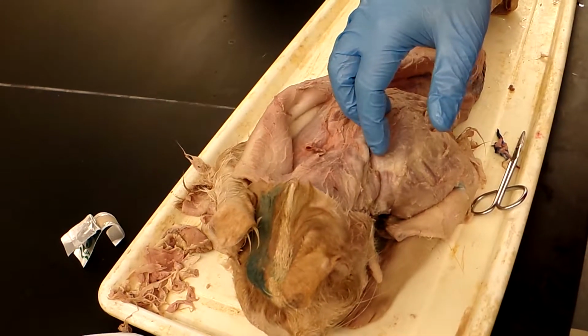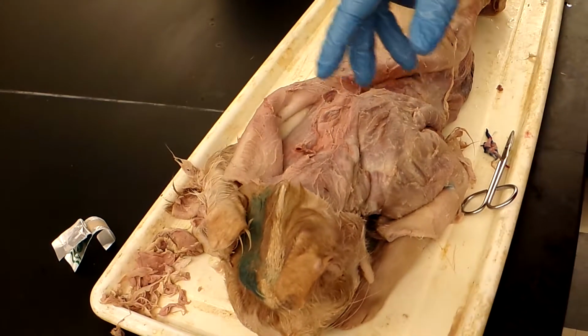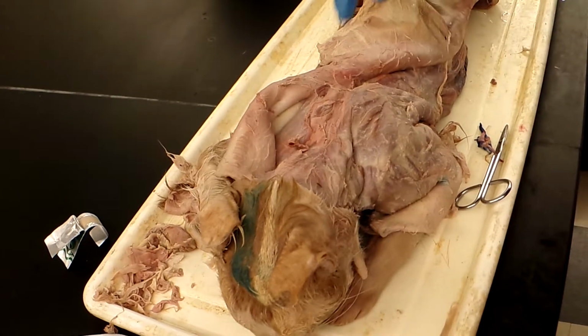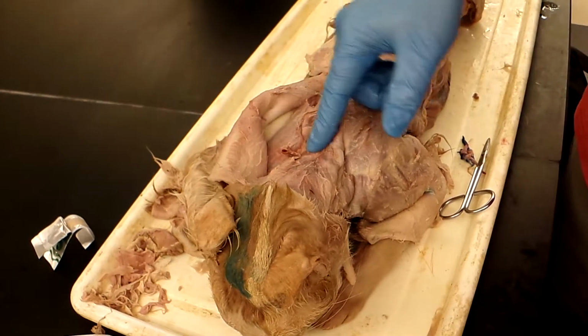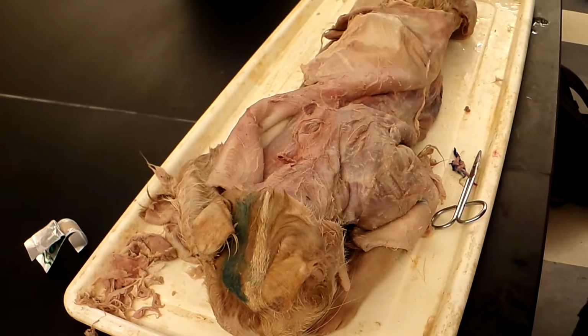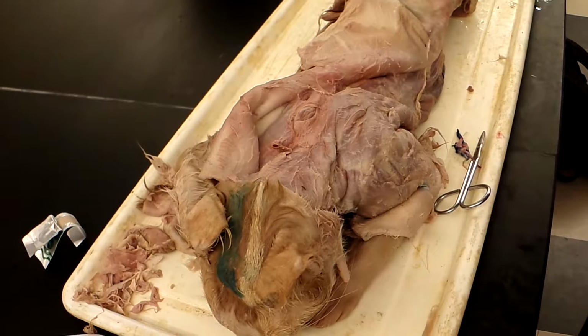Next is the rhomboideus, which is located right between the rhomboideus capitis, right down the middle, and the origin is the thoracic vertebrae. The insertion is the scapula, and the function is that it elevates the scapula.